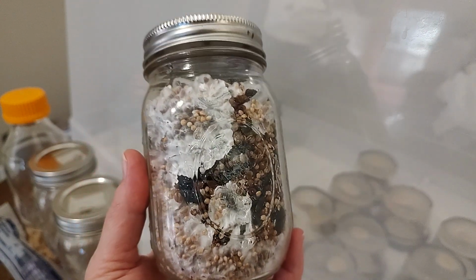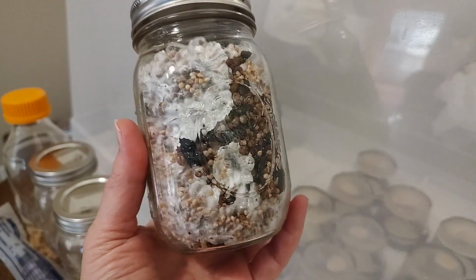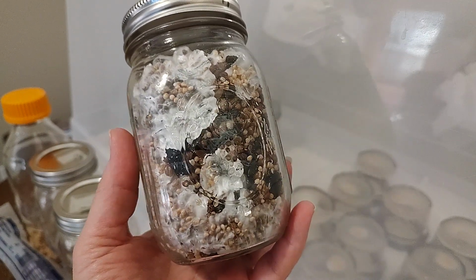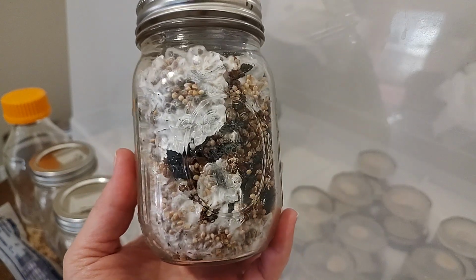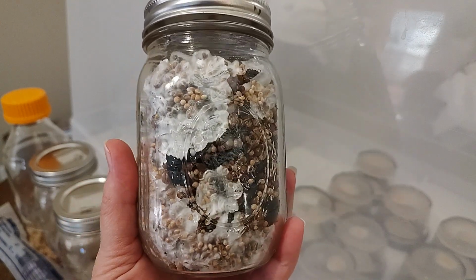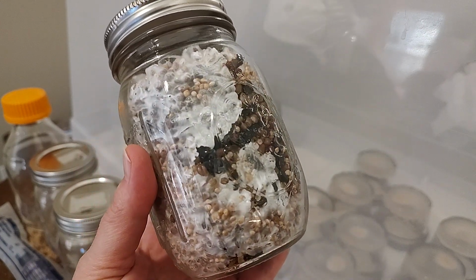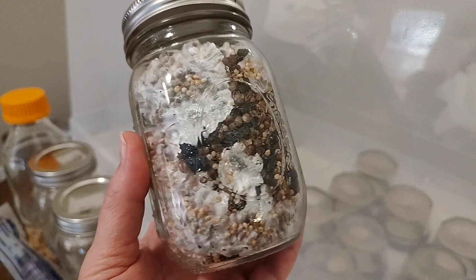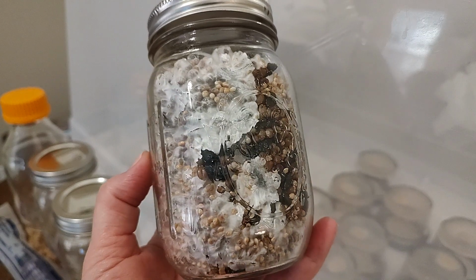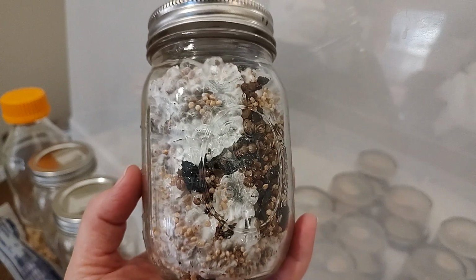Again, when you're working with the spore, spores are inherently dirty. They just are. Even if you're getting the best spores, and if you're working with the spore prints that you created, they are dirty. There is contamination, and that's okay. The point is, you put the spores to agar, and we recommend that when you're working with spores, you do a water agar, and we have a video on water agar. It's just purified water and agar, so there's no sugars or nutrients for contamination to feed on. It's a little bit slower grow for your spores in the water agar, or you can do an incredibly light MEA.